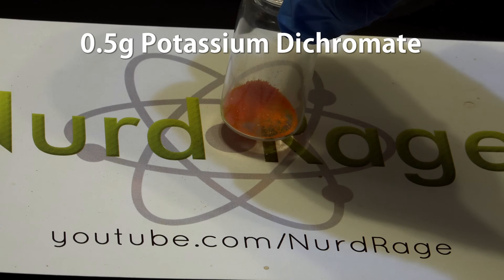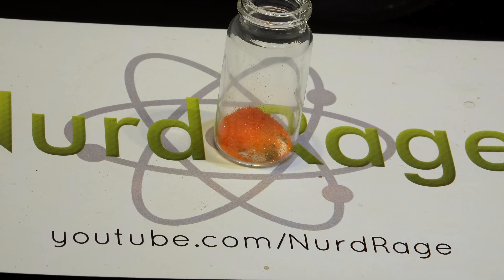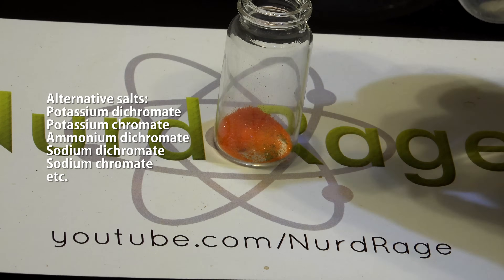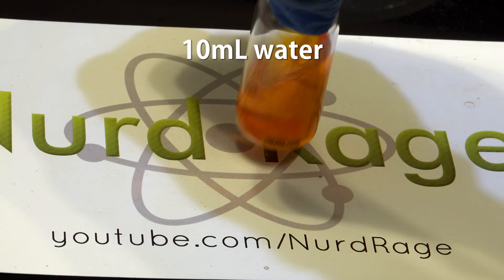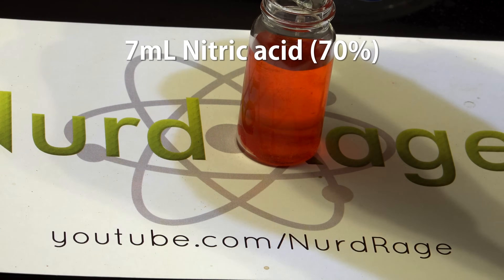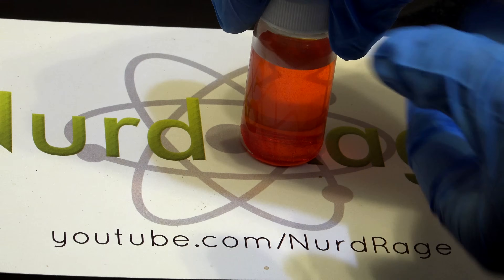First we start with 0.5g of a dichromate or chromate salt. You can use just about any salt including potassium dichromate, ammonium dichromate, or sodium chromate — they'll all work. To this we add 10mL of deionized or distilled water and give it a shake. Then we add 7mL of concentrated 70% nitric acid. Cap it up and shake it until all the chemicals dissolve.